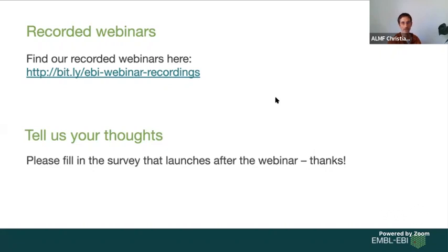So then the workflow I would probably do, because I like MorphoLibJ, I would use MorphoLibJ for segmentation. Then I would produce a label mask image as a function of time. And I would go with this into TrackMate. And fortunately, since very recently, this is possible. So you can actually, as an input for tracking, use label mask images in TrackMate. So that would be if you want to segment outside TrackMate. But otherwise, TrackMate for tracking, yeah.